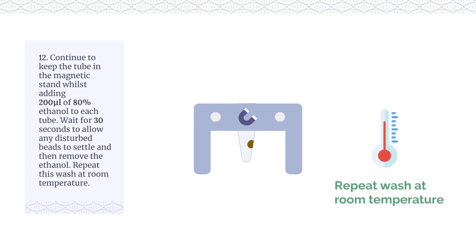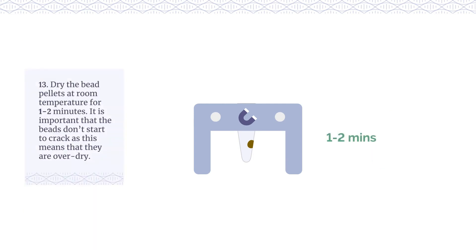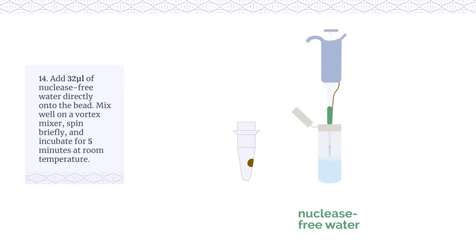Repeat this wash at room temperature. Dry the bead pellets at room temperature for 1-2 minutes. It is important that the beads don't start to crack as this means that they are over dry. Add 32μL of nuclease-free water directly onto the bead.